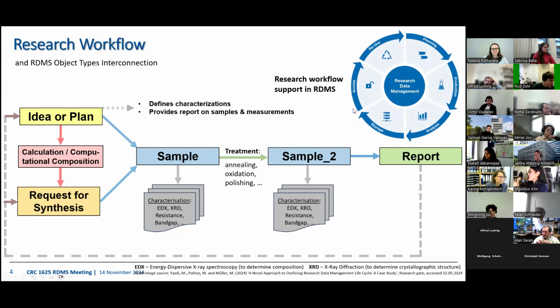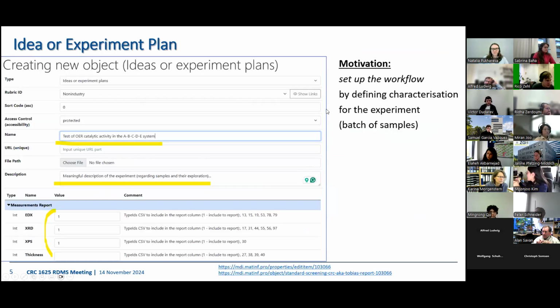So everything is trackable, of course, within the research data management system.